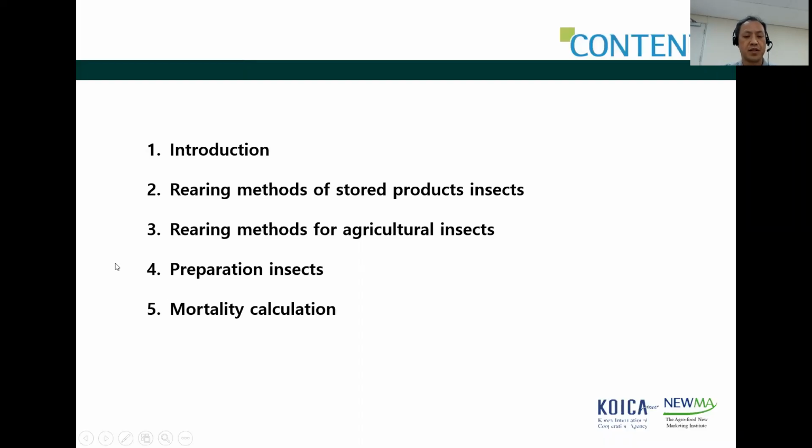I made a presentation in the following order: introduction, rearing method of stored products insects, rearing method for agricultural insects, preparation of insects, and mortality calculation.